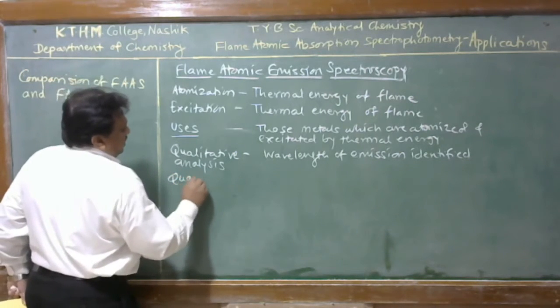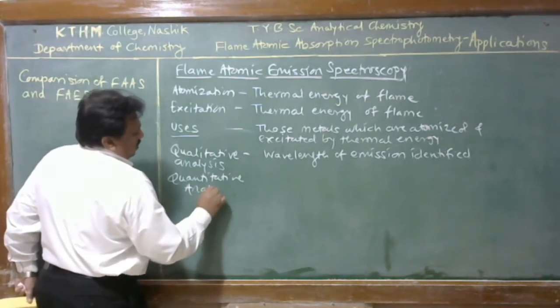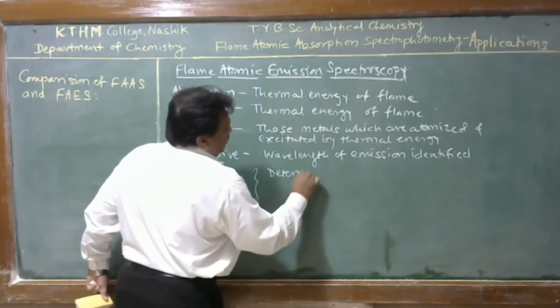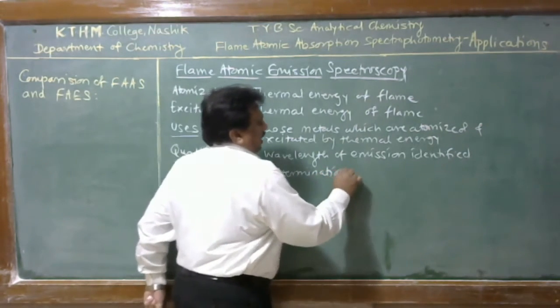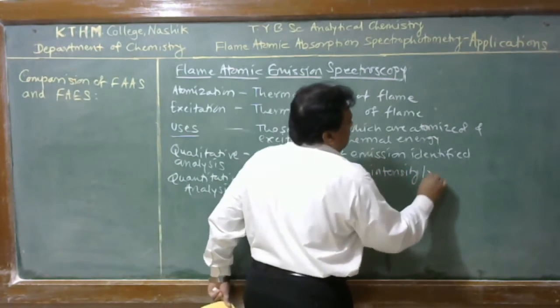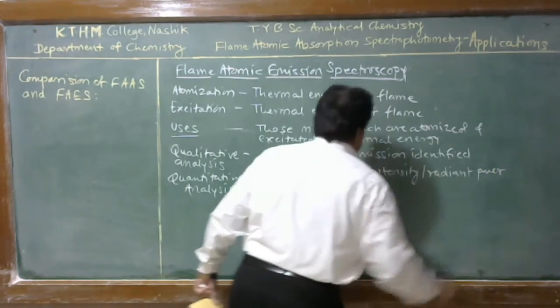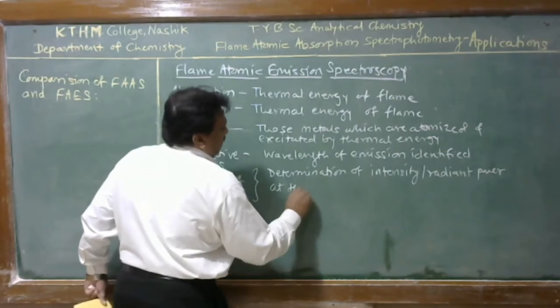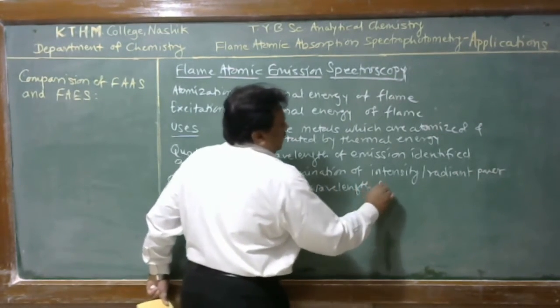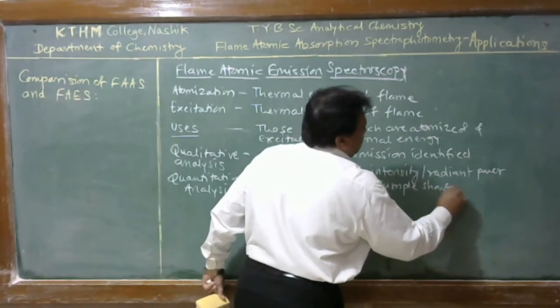Then quantitative analysis is related with the determination of intensity or radiant power at the wavelength where the sample shows emission.